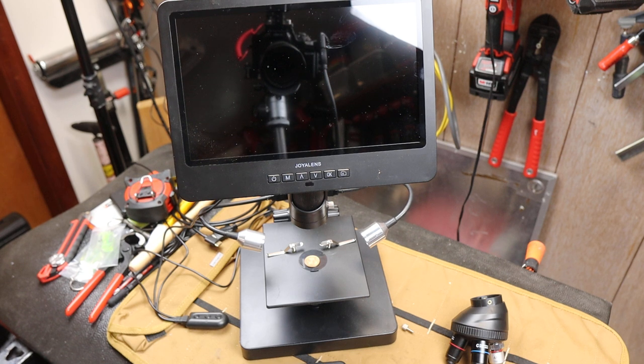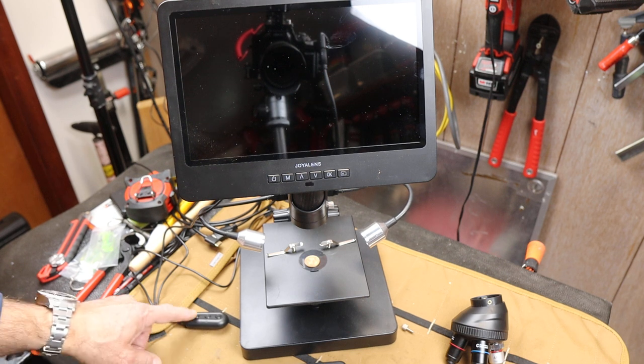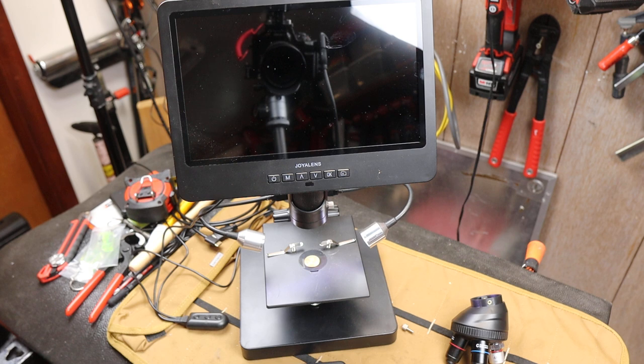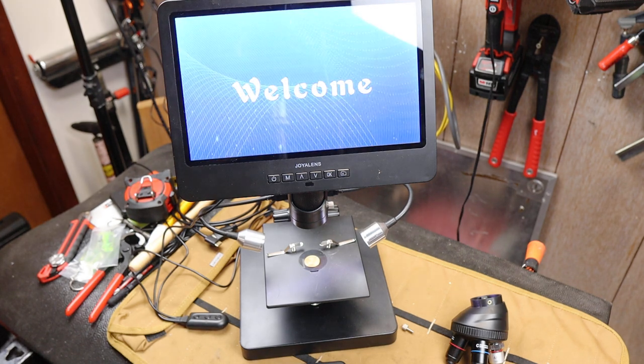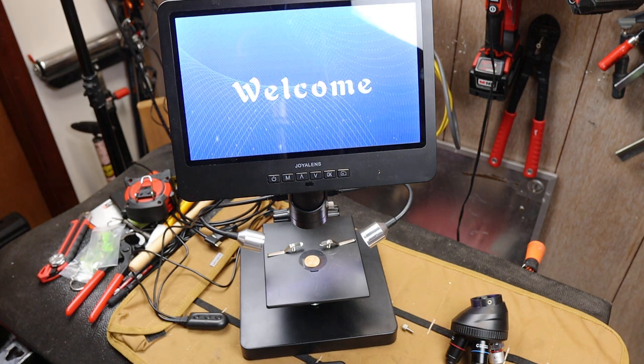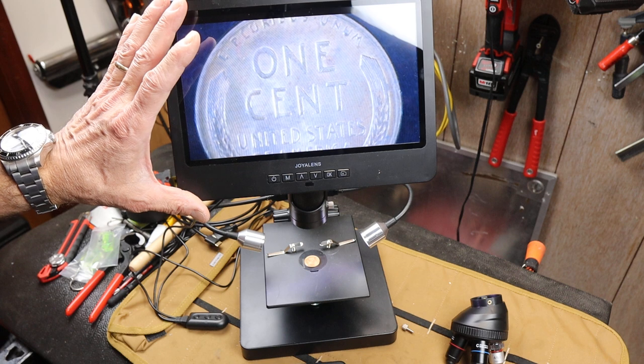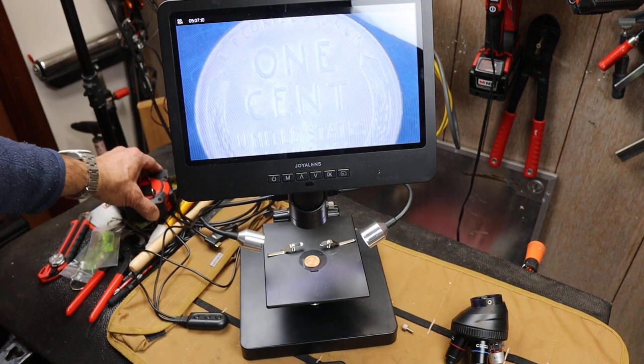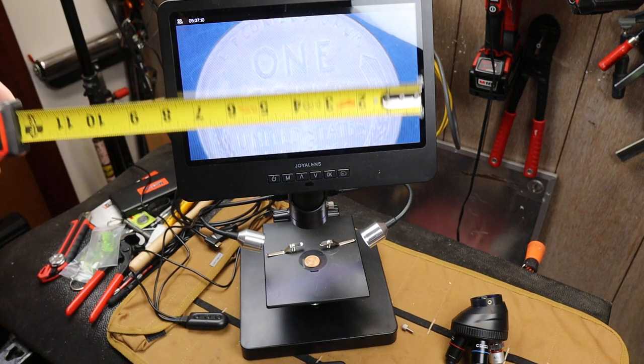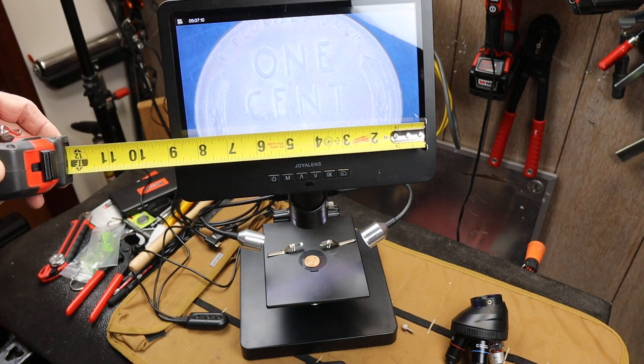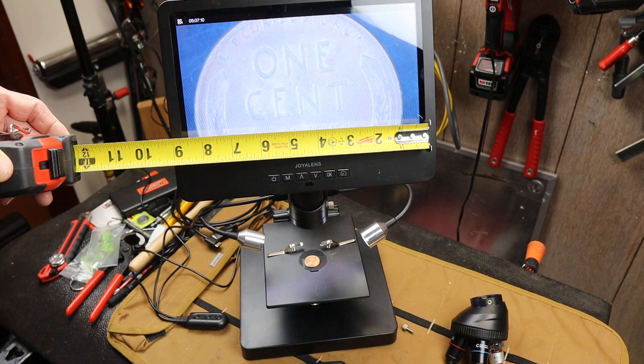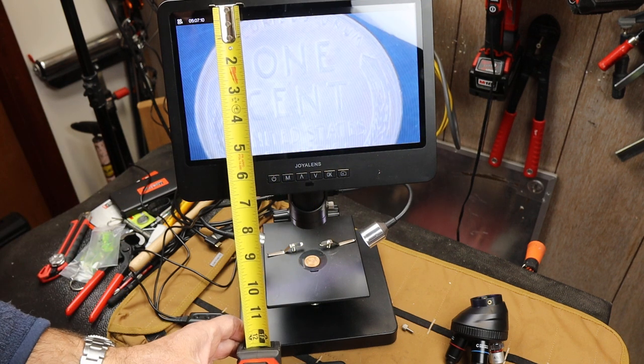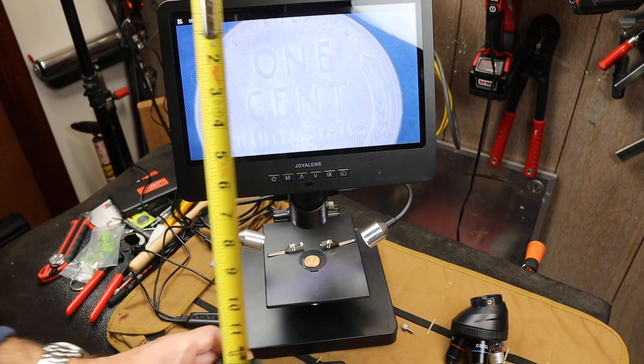Howdy folks, Doc here with Last Best Tool, and this is the Joya Lens JL249 Digital Microscope. It's a fairly large digital microscope. In fact, you can see with my hand here, the screen alone is almost 9 inches by over 5 inches.